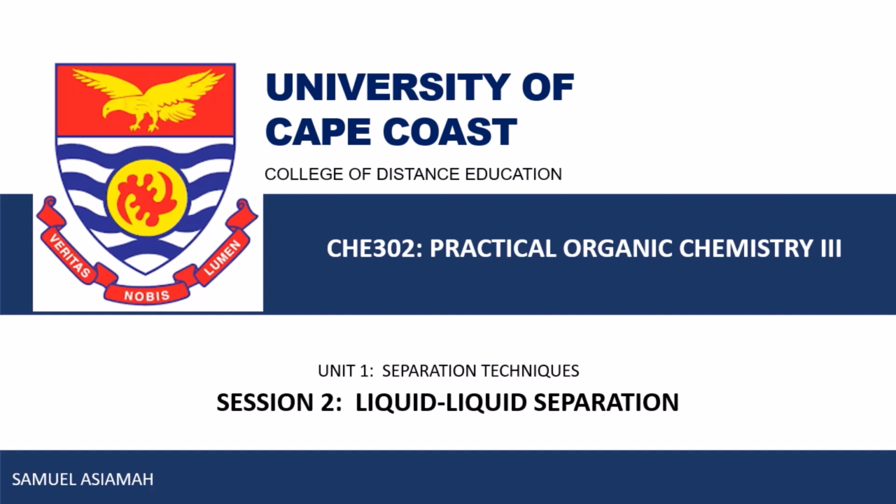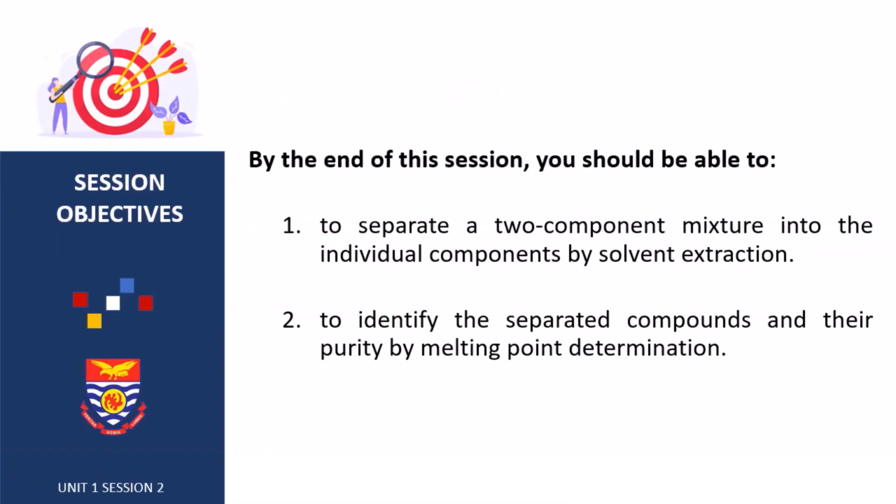Everyone, you are welcome to the second session under Unit 1. In this session, we are going to look at liquid-liquid separation. At the end of the session, you should be able to separate a two-component mixture into the individual components by solvent extraction. You should be able to identify the separated compounds and their purity by melting point determination.